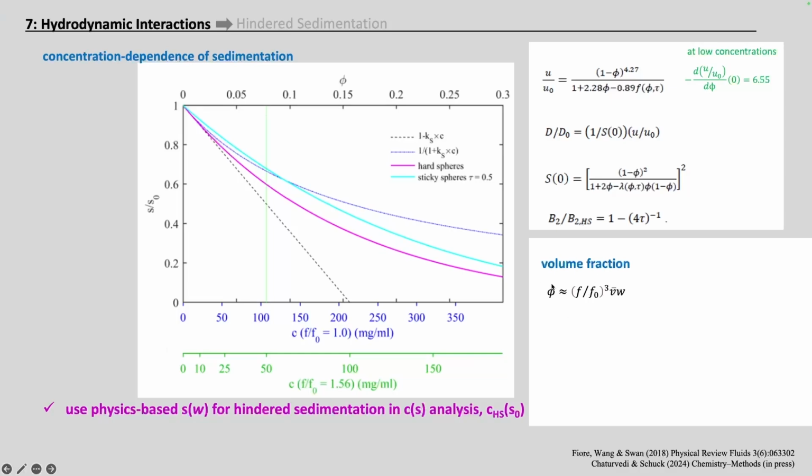Because this is a rough approximation, let's say it's the product with a correction factor called reduced Ks, which we'll expect to be around 1. Why do we call this reduced Ks?